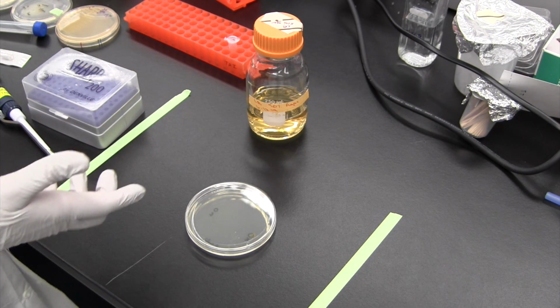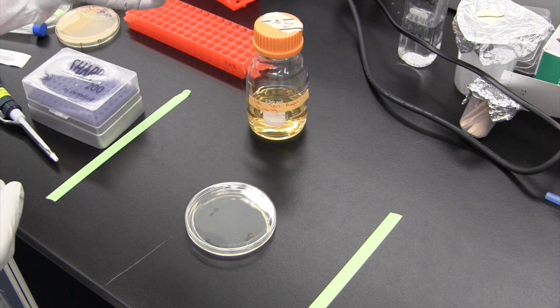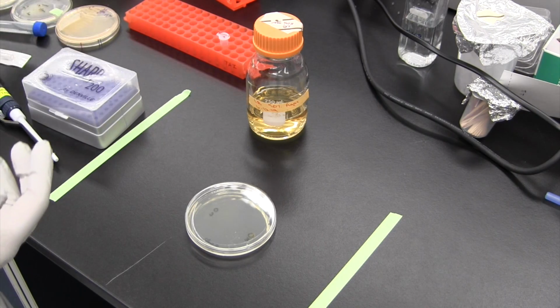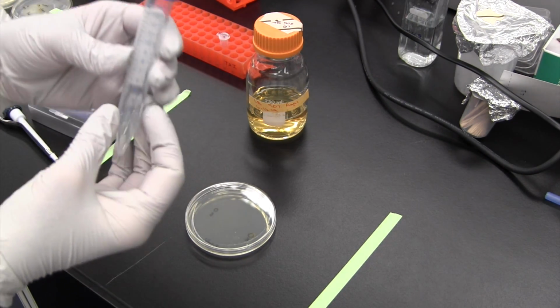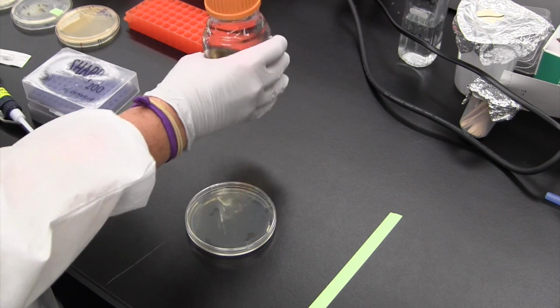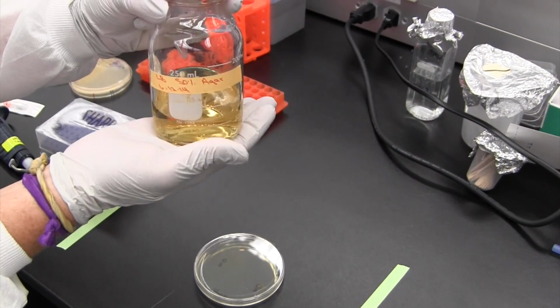So at this point we're getting ready to make our agar overlay. The way that we're going to do it is we're going to use B. subtilis as an overnight culture. I'm going to take 100 microliters from our B. subtilis and add it to a 15 mil centrifuge tube. And then I'm going to add 7 mils of hot agar. So this is a 50% LB agar, and we just microwaved it.